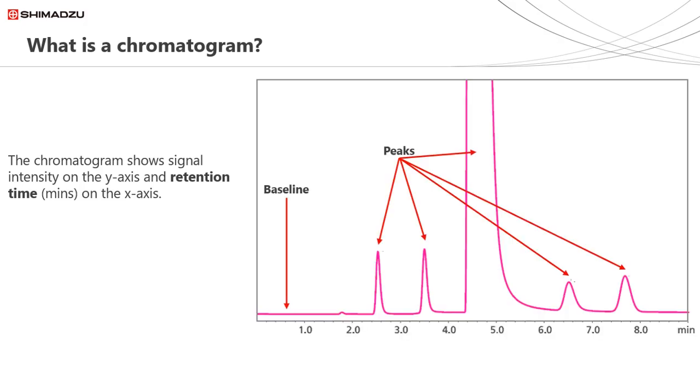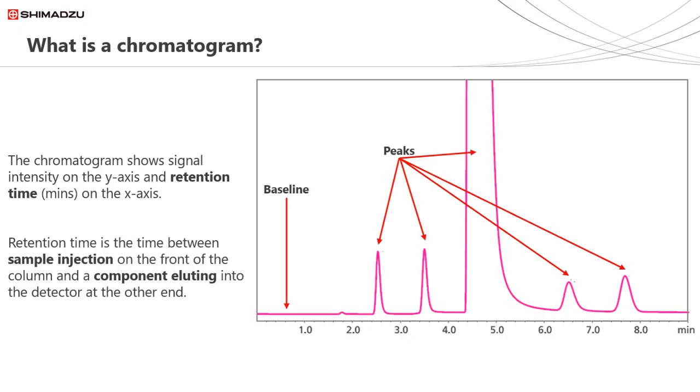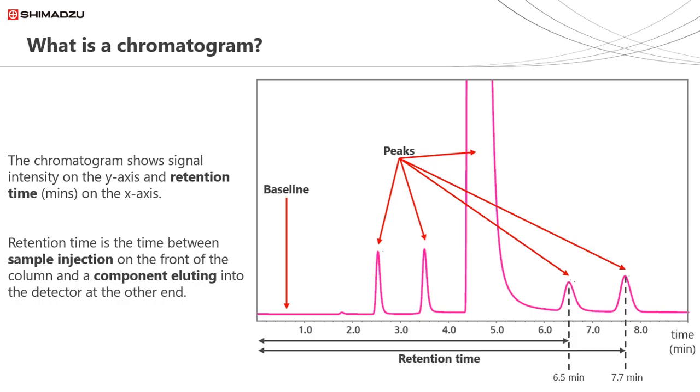We then looked at the output, the chromatogram, and covered all relevant segments. The x-axis, which calculated the time the components were retained from, known as the retention time, the peaks representing our individual components, as well as the baseline and the base signal, and finally the peak areas used for calculations such as concentration.